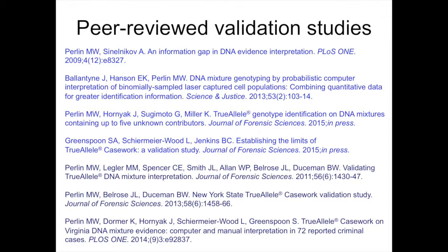This allowed us to test the capabilities and limits of the TrueAllele system since we knew the compositions of all of the mixture contributors. And the 3 papers on the bottom were done on casework samples, which allowed us to see how TrueAllele behaves in practice on actual, less pristine casework data. The 2 most recent publications will come out in the Journal of Forensic Sciences next year.